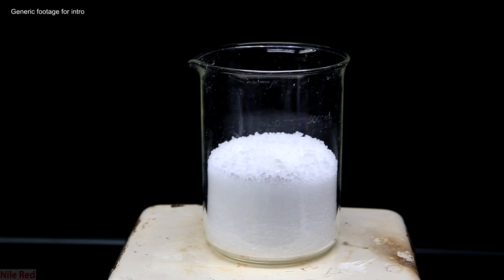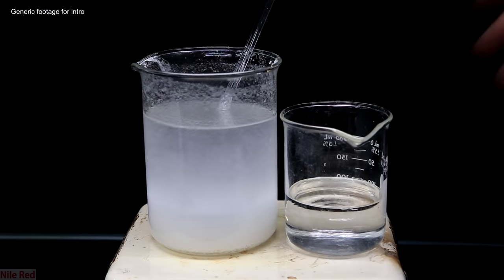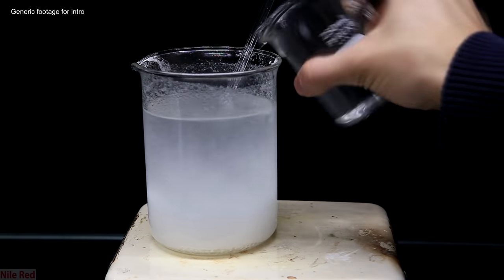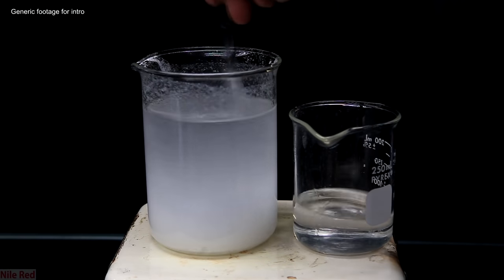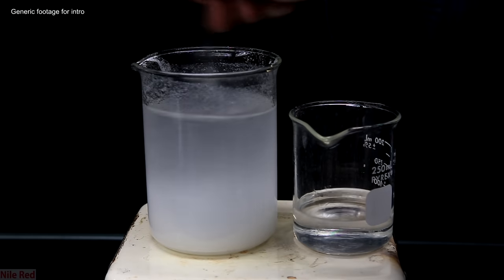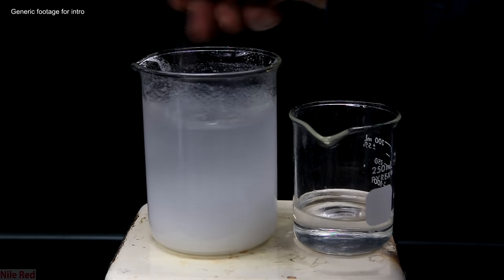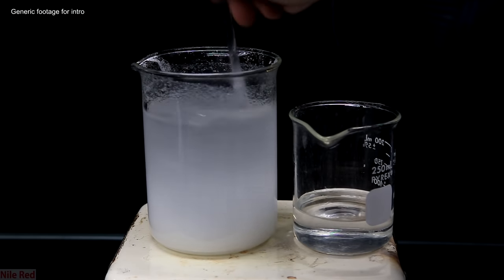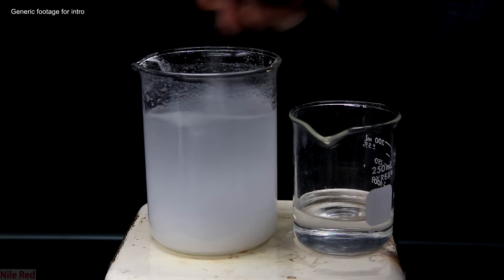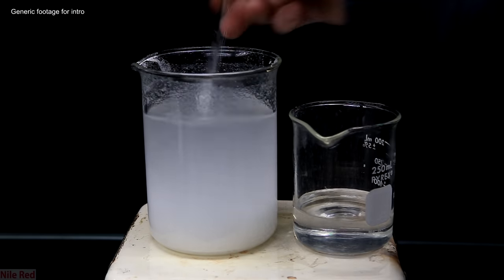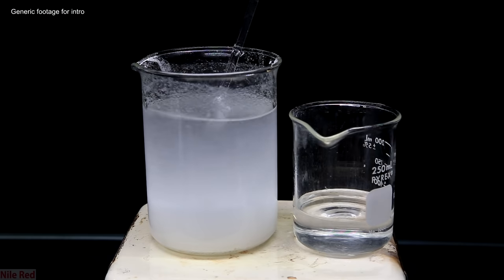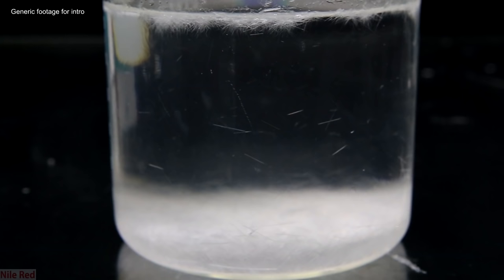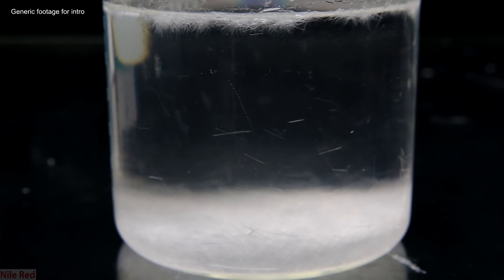The last technique that I didn't think I'd go over, but decided that I will, is a technique that you probably will not carry out, especially if you're doing chemistry at home. This technique involves dissolving your compound of interest in a mixed solvent system, but then selectively pulling off one of the solvents with a lower boiling point under vacuum. For example, let's say we use lidocaine and we dissolve it in an ethanol water mixture.